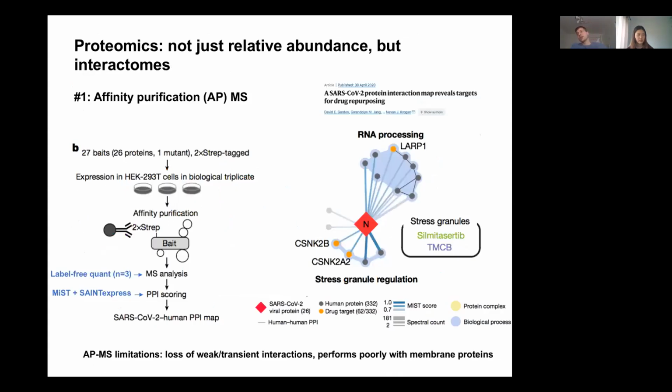Okay, so this is now probably one of the more interesting examples for all of the pharmacologists or true biologists in the audience, because you can do unbiased screens of affinity purified samples, of IPs and things like this. Instead of running a million Westerns to see if other proteins of interest came down in the IP, you can just digest your samples, run them on the mass spec, and get an unbiased look at everything in the mixture.